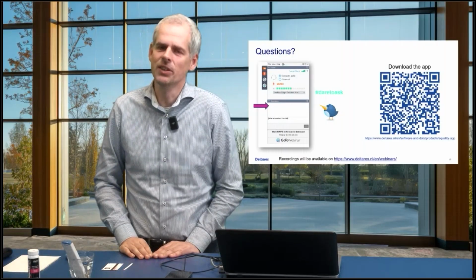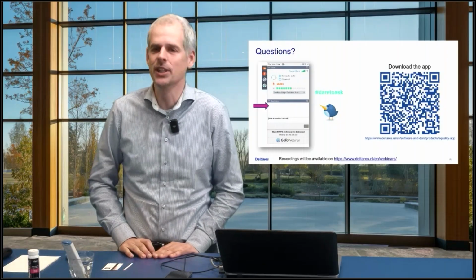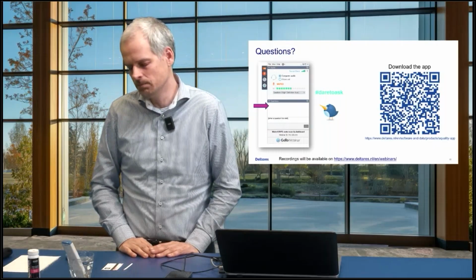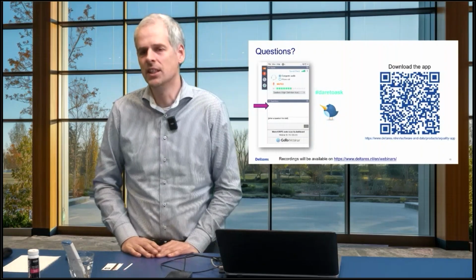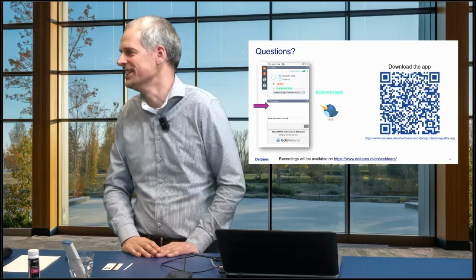So there's no real option to say within the app, okay, I diluted this sample. That could be a nice addition, although the nitrate can go up to 50 nitrate N. So if you're above that, then I think there's a problem anyway, especially when it's drinking water.